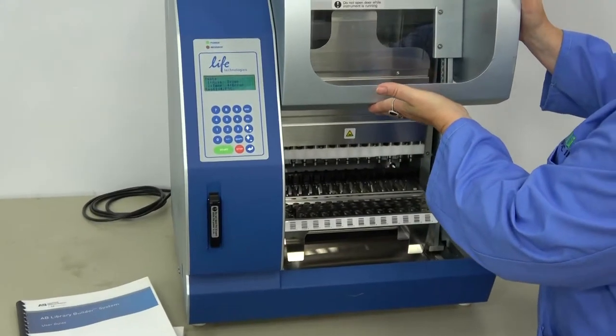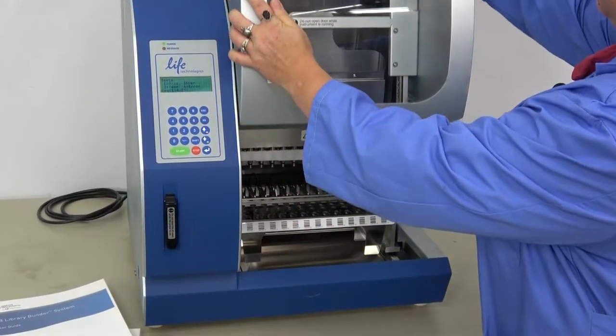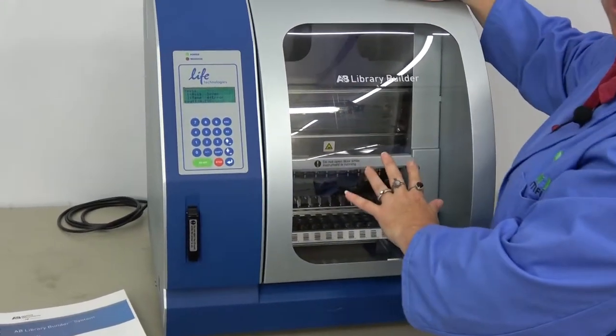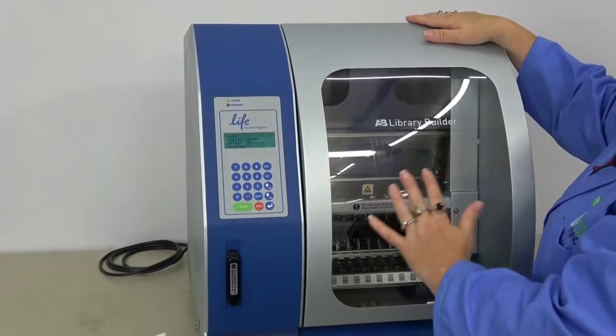The door slides up. You would enter your samples and reagents here and the magnet catches it. Even though we don't have samples or reagents, we're going to go ahead and run it through a testing sequence so that you can see that it is functioning.